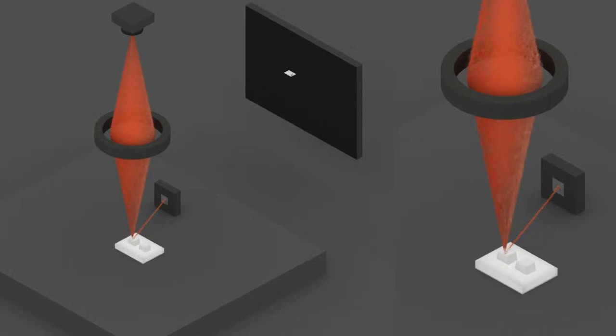Because the composition or surface profile vary from point to point on the sample, the detector would measure different signal strength. This gives the contrast, which allows us to build an image of the sample surface as the electron beam scans.